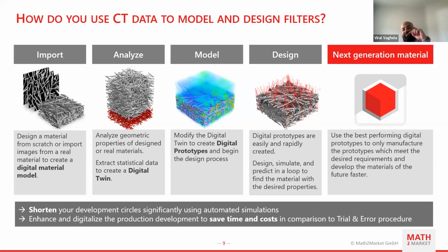I think you answered the question in terms of just saving time and being able to have multiple simulation samples available and only picking the right ones that actually matter to you. So it certainly can minimize a lot of time and money in terms of actual live samples that you're not using, because you're simulating most of it already. So start the simulation process over a weekend and get ready for an actual live sample comparison on Monday or Tuesday. And you can minimize to the correct candidate, I guess. So definitely really helpful in that process development. So no questions here. We can go on to the next one.